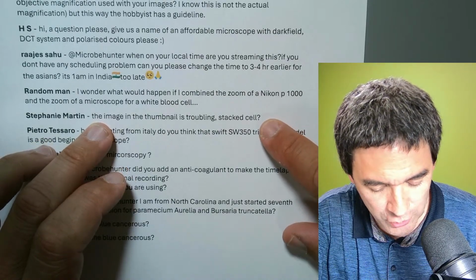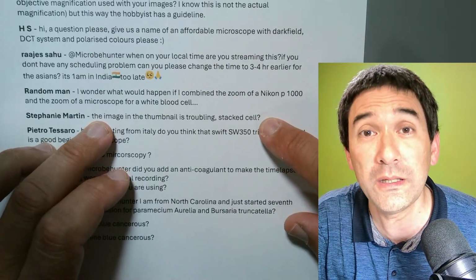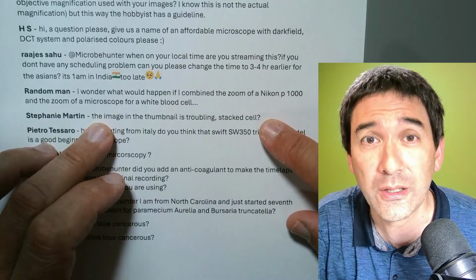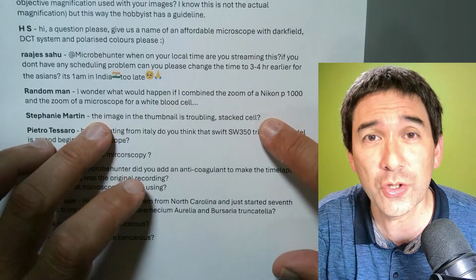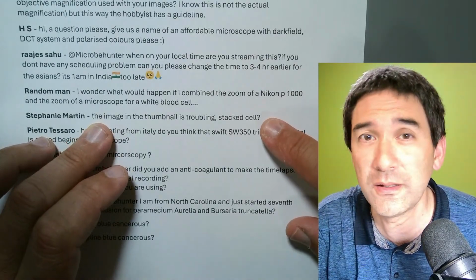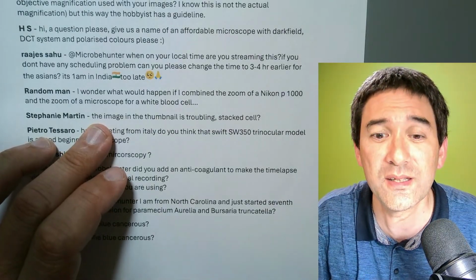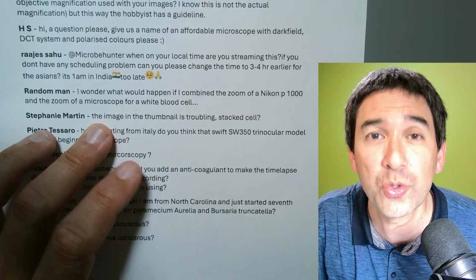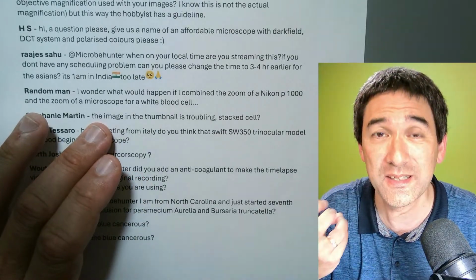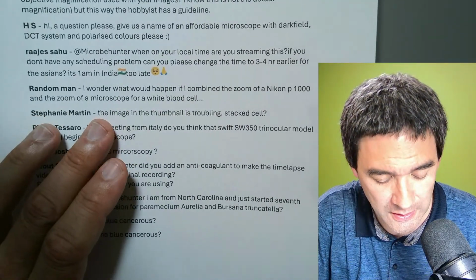The image in the thumbnail is troubling. Stacked cells, yeah, that's called rouleau formation, and I showed it to you as well. That's a completely normal thing that happens when blood starts to dry out. If you do a little bit of research, you're going to see that rouleau formation, the stacking of cells, could be the sign of certain diseases. But this happens in any case. You can only use this as a diagnostic indicator in highly standardized conditions, which we're not able to have. Sooner or later, pretty much all of the cells are going to stack up as the blood starts to dry up and coagulate. So that is a completely normal process.